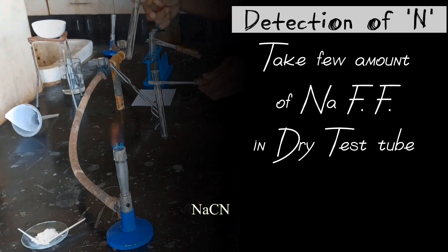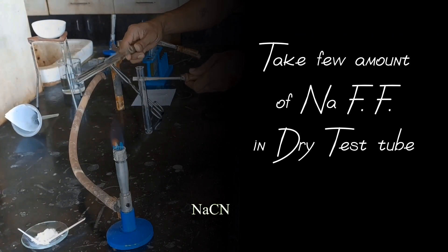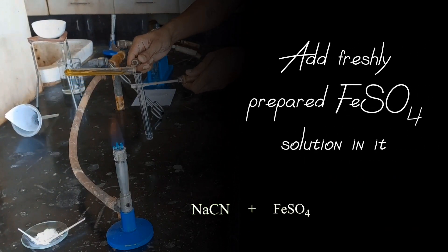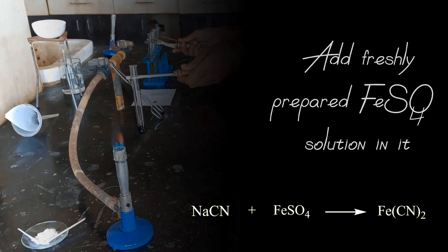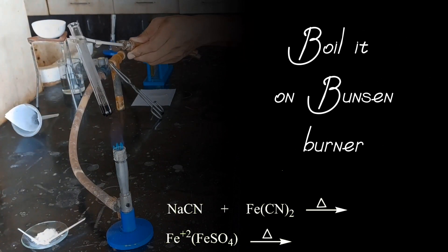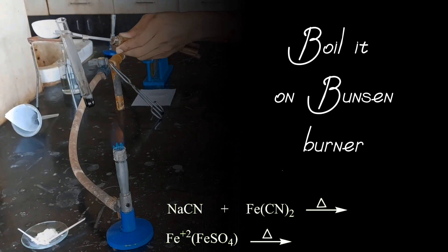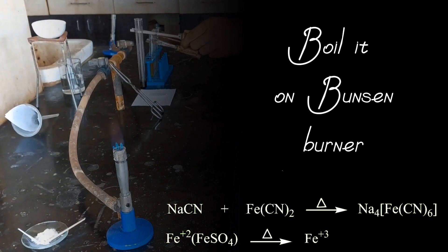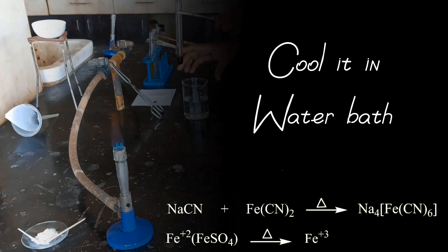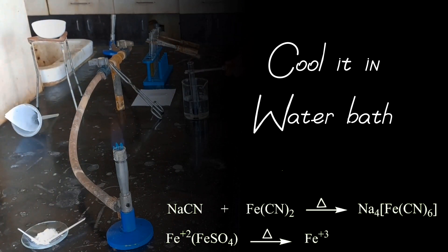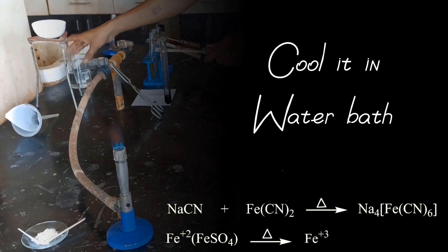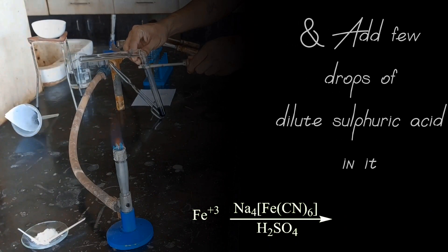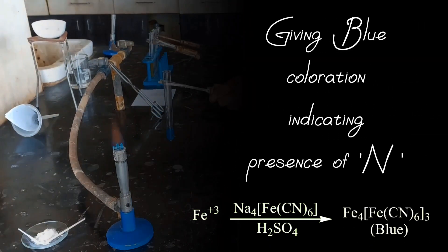Let us do detection of Nitrogen. Take few amount of sodium fusion filtrate in dry test tube. Add freshly prepared ferrous sulphate solution in it. Boil it on Bunsen burner. Cool it in water bath and add few drops of dilute sulphuric acid in it, giving blue coloration indicating presence of nitrogen.